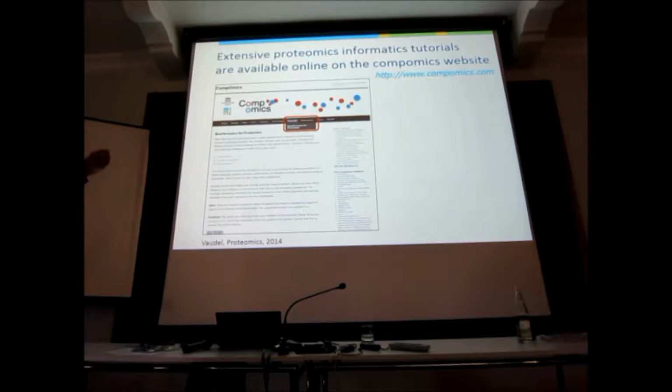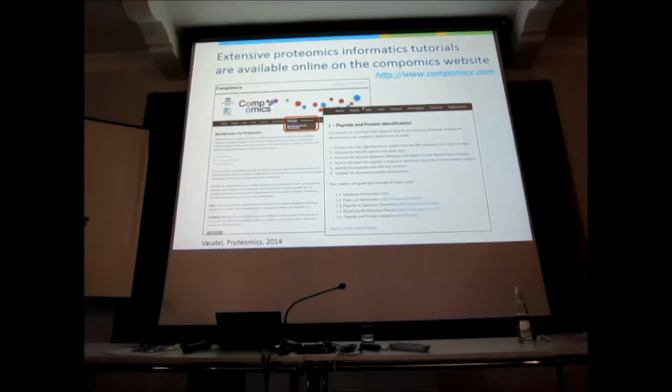And for that, we have made an extensive series of tutorials that explain just about anything, at least in identification right now. Quantification is coming up. They're freely available on the website of my group. There's a link to tutorials, and then it says Bioinformatics for Proteomics, so you really can't miss. And then it has all of these different sections. This is the first section, peptide and protein identification, and then it has these different topics, and it really goes step by step through everything. And it has PDFs with all the documentation.